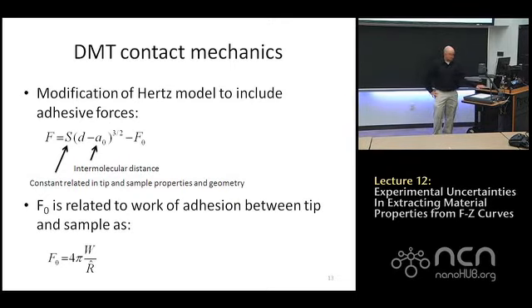May I ask one more question? Yeah, please. For the DMT model, right? And there is another one, JKR. And in your opinion, DMT is a better approximation than JKR? I don't take into account Hertz because Hertz doesn't take into account interactions. Right.